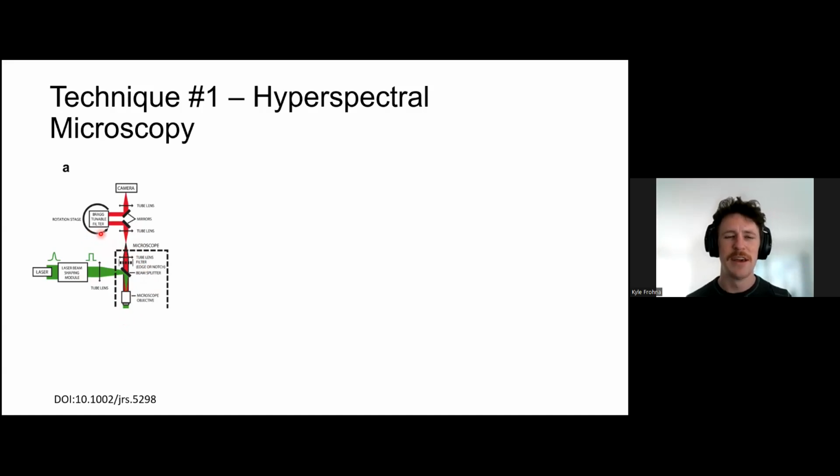The magic happens in this backstage, which is where the light is incident on what's called a Bragg tunable filter. It's a bit like a grating, but rather than periodicities in 2D, it's actually periodicity in 3D through a piece of glass, where the refractive index of the glass has been modulated throughout the thickness of the glass. It basically allows you to produce a bandpass filter, if you will, with an extremely small bandwidth.